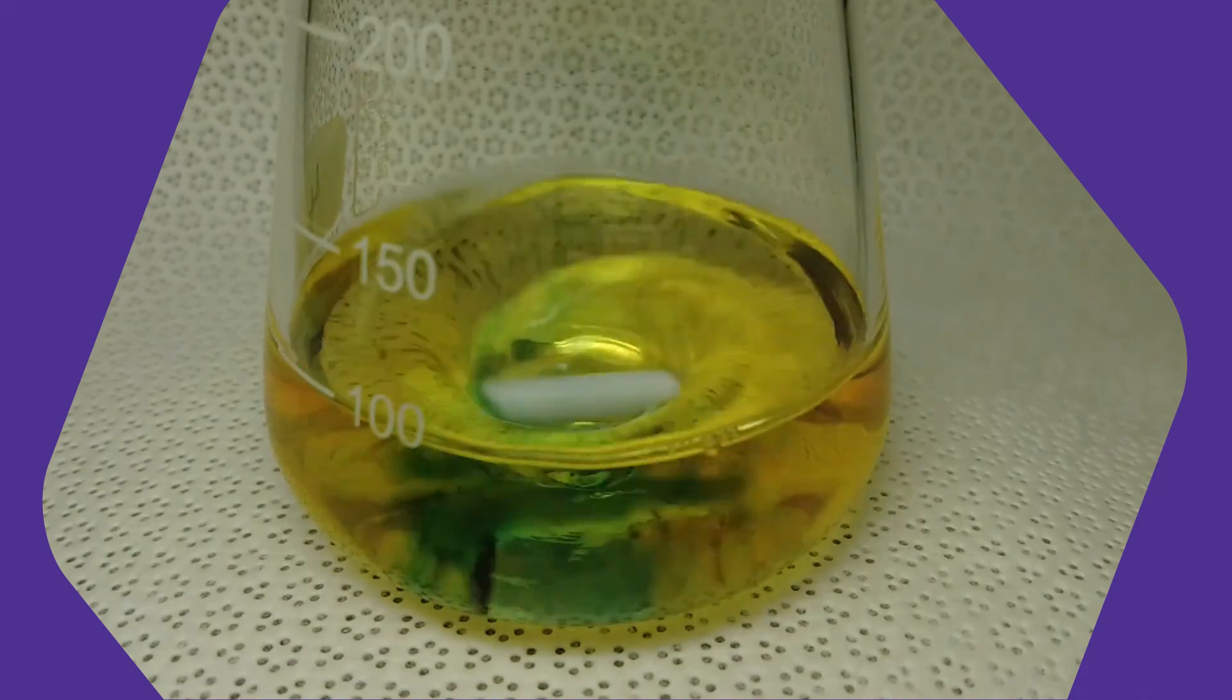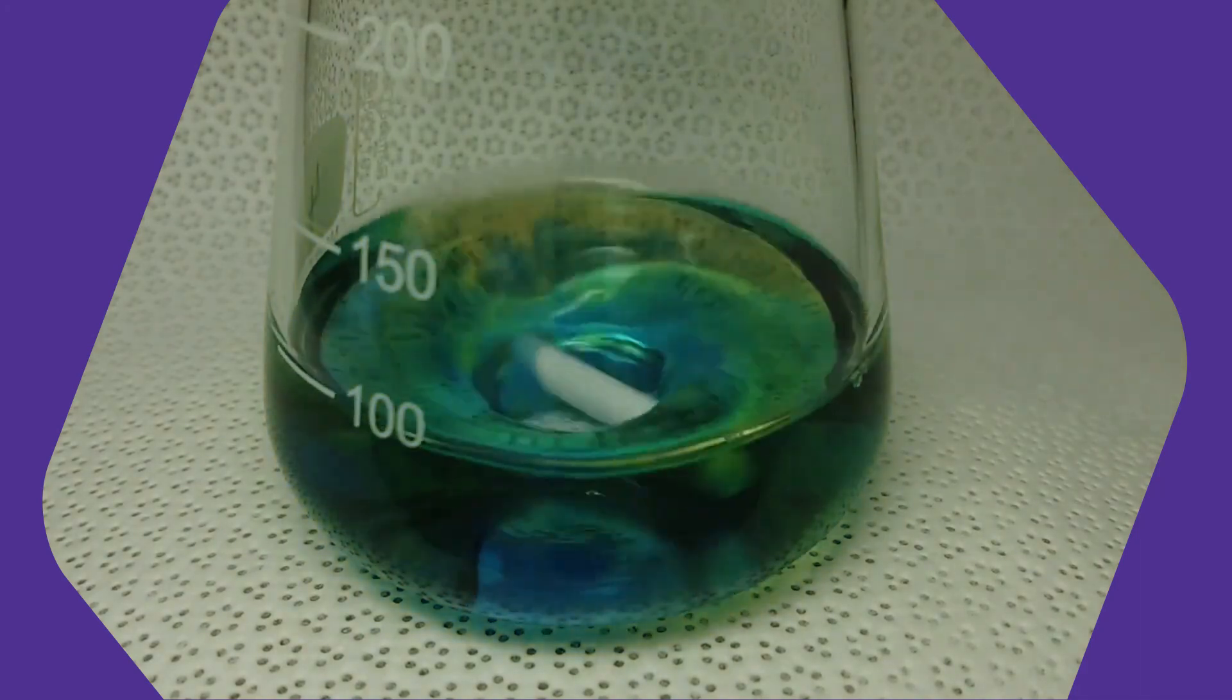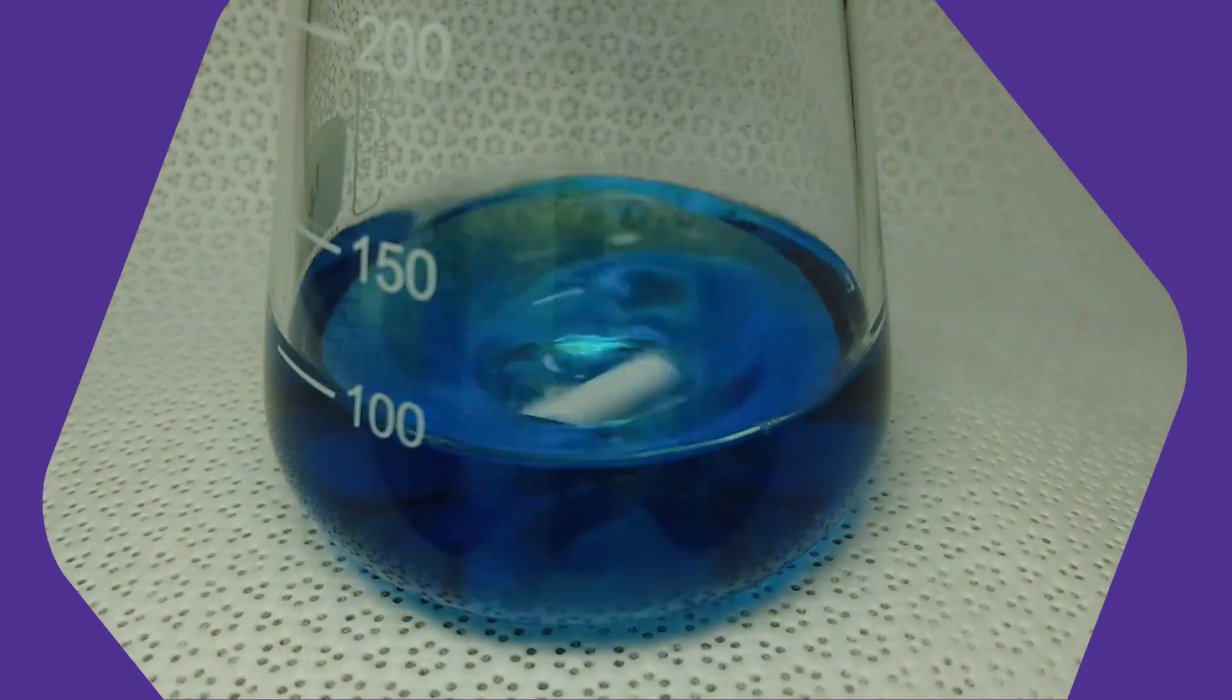A challenge is to exactly determine when the equivalence point is reached. A simple solution can be using an indicator like in our experiment. An indicator is a substance which can change its color depending on the environment. In our case, depending on the pH value. The sodium hydroxide solution has a very high pH value. At the equivalence point, the pH value drops to 7 and the indicator changes in color.